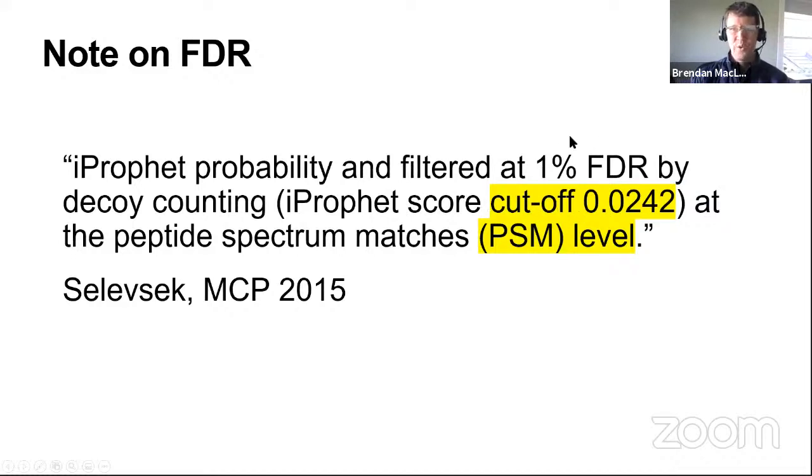So I came away from reading this sentence with a pretty deep foreboding about the false discovery rate in the library if it were built that way. But luckily, although all I had was the library, I was able to contact Ludovic and Natalie and get the raw data. So we're going to build our own library here, and we're going to choose a different cutoff.